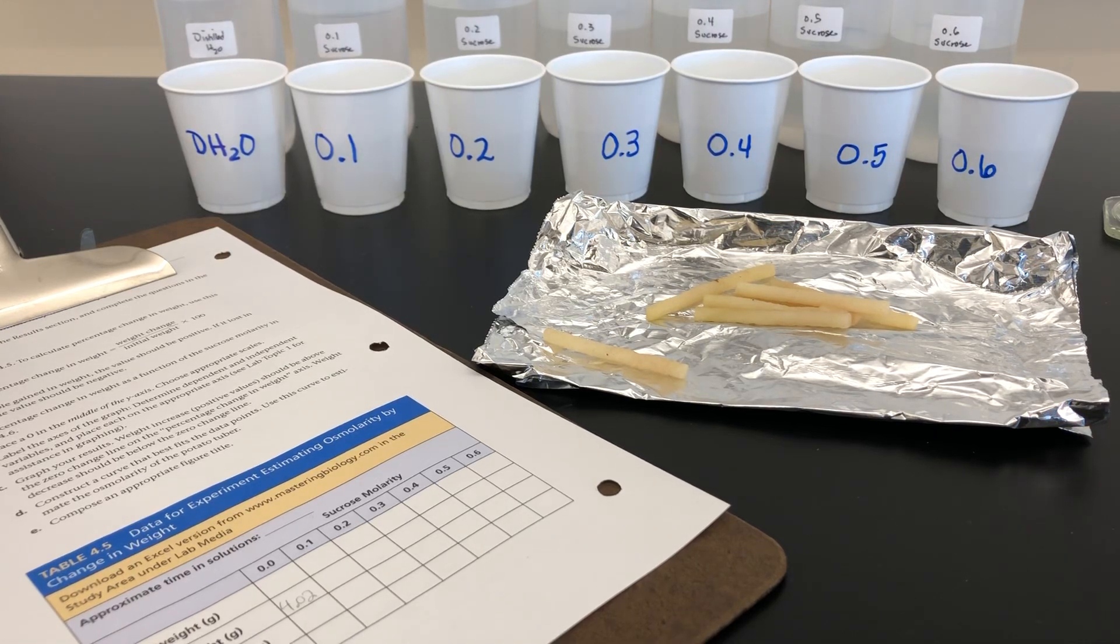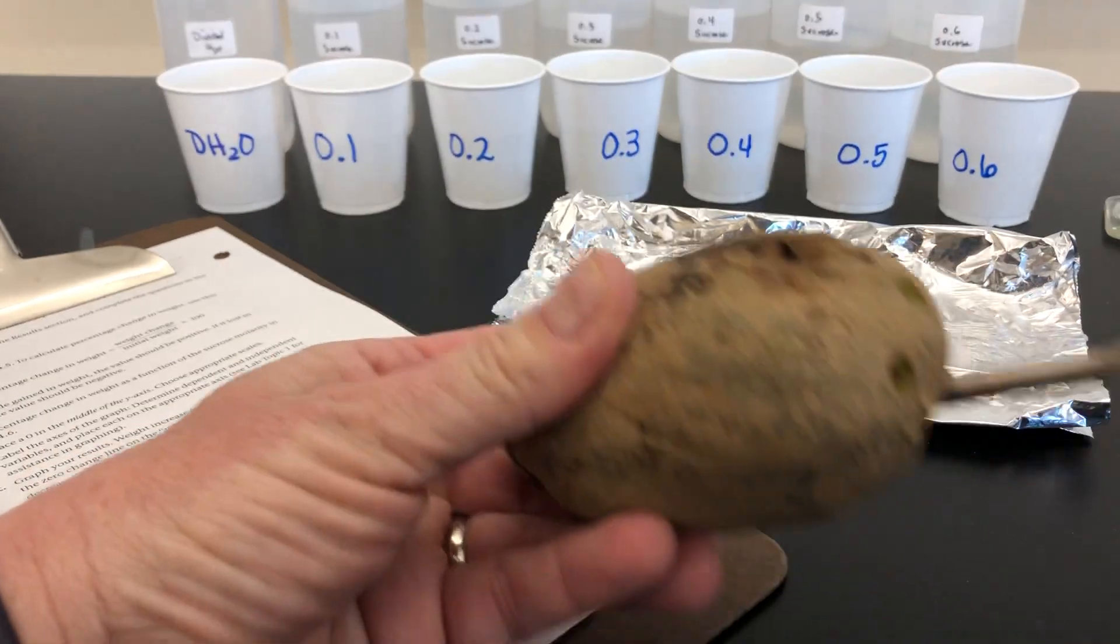This is the setup for Activity A, Exercise 4.3. In the foreground, you can see long cylindrical cuts of potato. I've done that by using a boring apparatus.